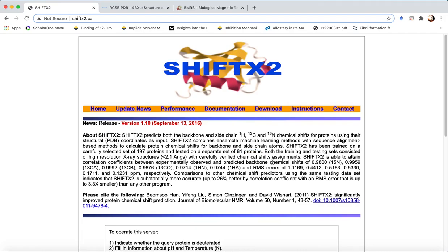is highly accurate. Now, a problem that you might face in this regard while predicting the chemical shift values is the degeneracy of the particular chemical shift, especially in the case of the hydrogen chemical shift. You might see that these values are actually coinciding or correlating with each other quite often for different systems and different proteins.